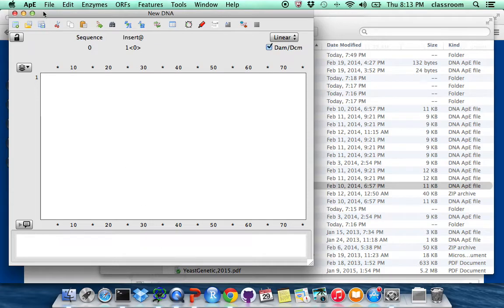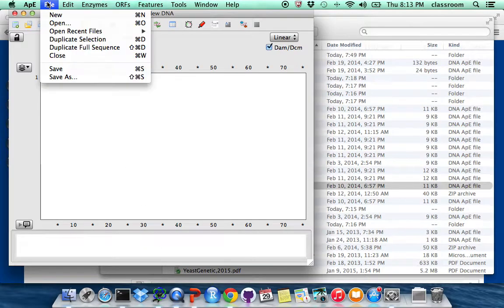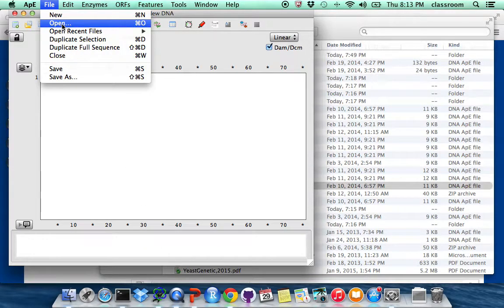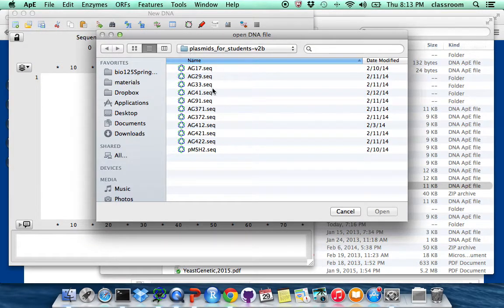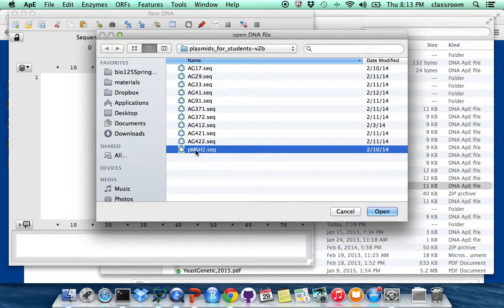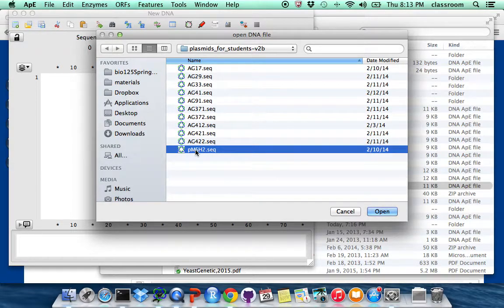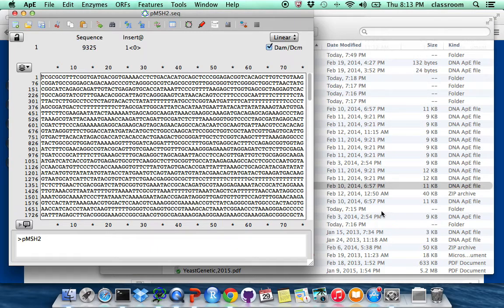So first, let's open APE, then go to File, Open. I'm going to pick PMSH2 sequences for demonstration.